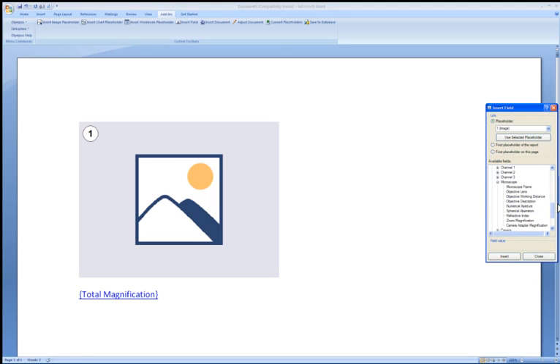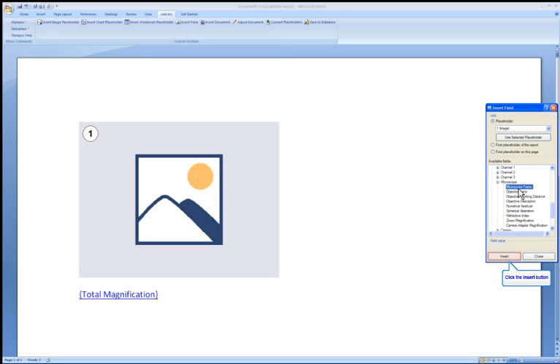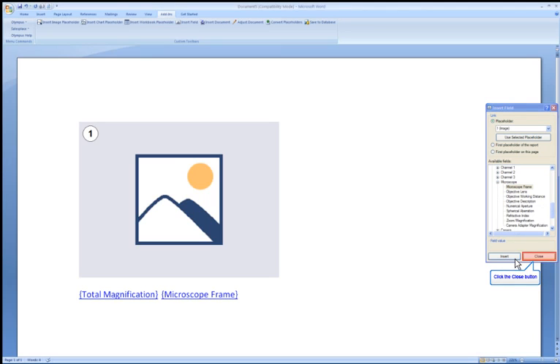Let's insert one more field from the microscope list. Choose Microscope Frame. Click Insert to place the field. We can now close the Insert Field tool window.